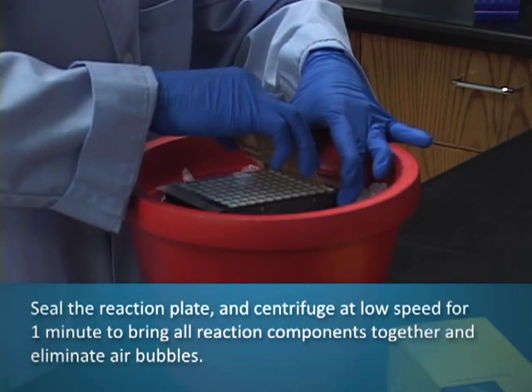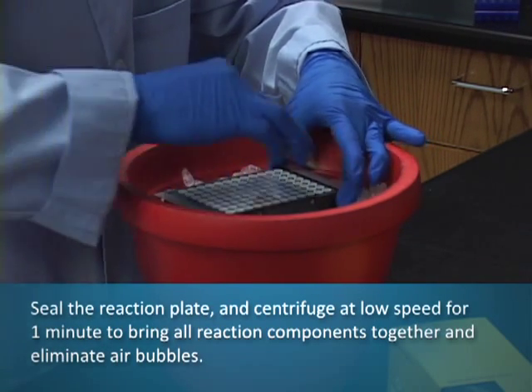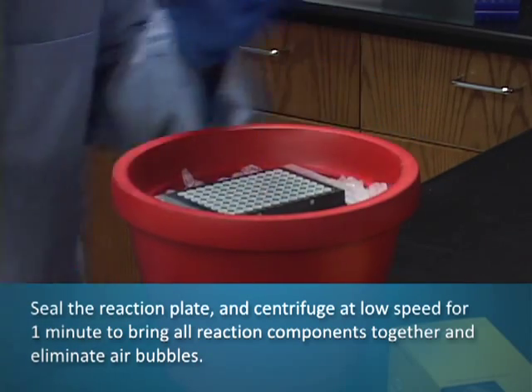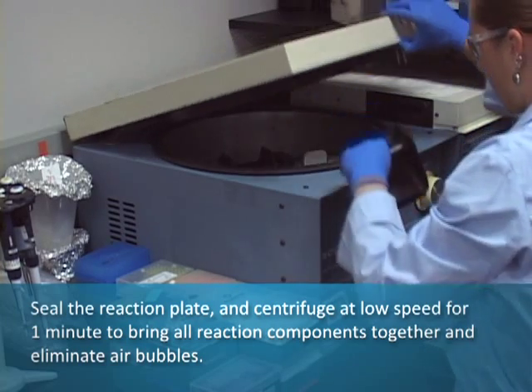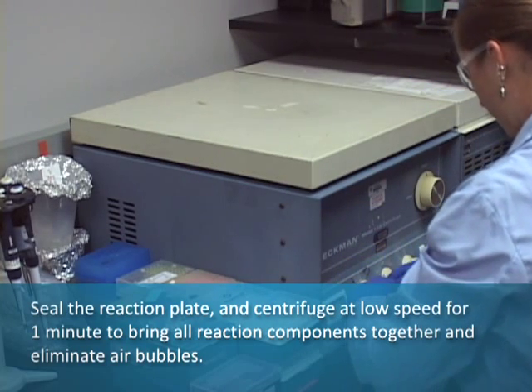Seal the reaction plate and centrifuge at low speed for one minute to bring all reaction components together and eliminate air bubbles.